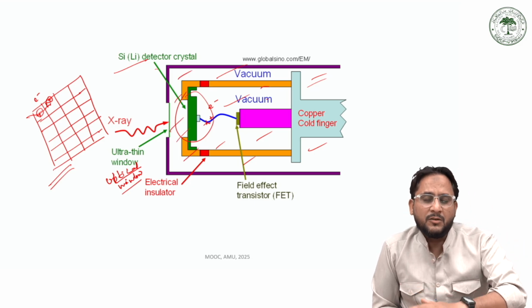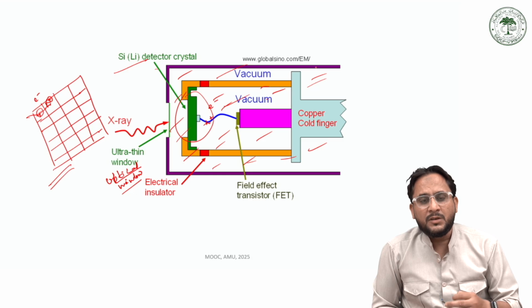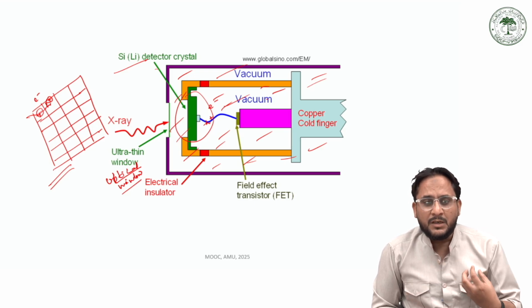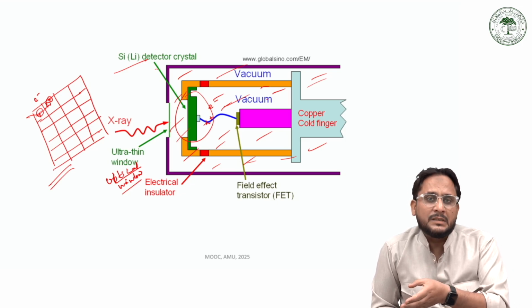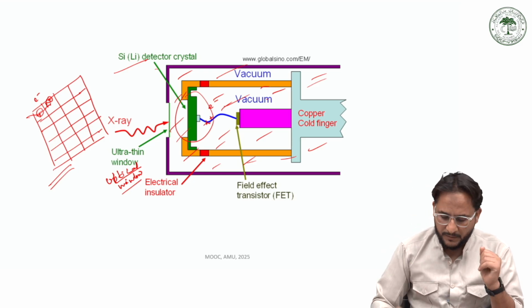For example, if air or oxygen were present in this space, the electrons, as soon as they are released, would be immediately taken up by oxygen, because oxygen is a very good electron acceptor. Oxygen would accept those electrons, forming a radical, and they could never reach the electrodes on the other side, and no current signal would be obtained.